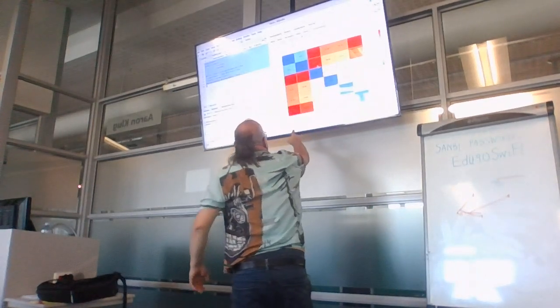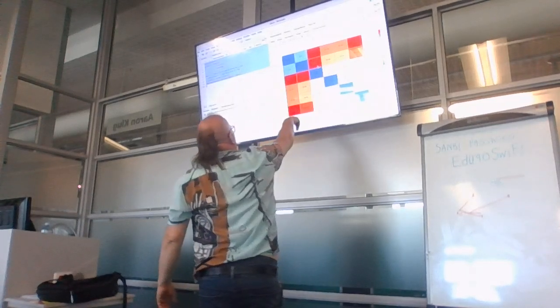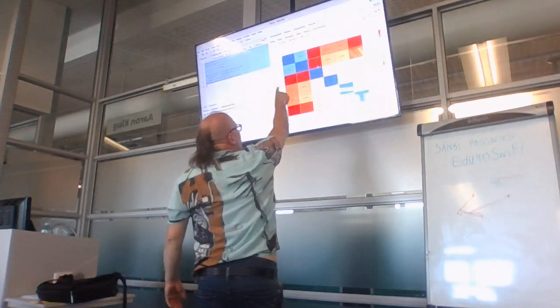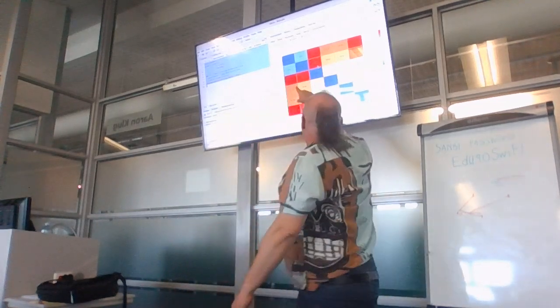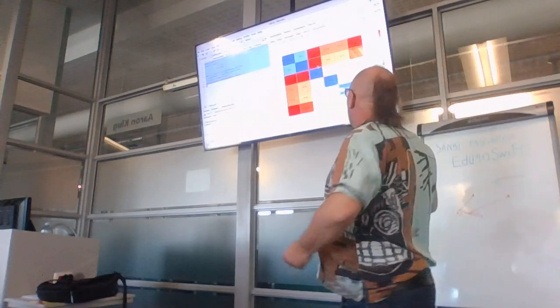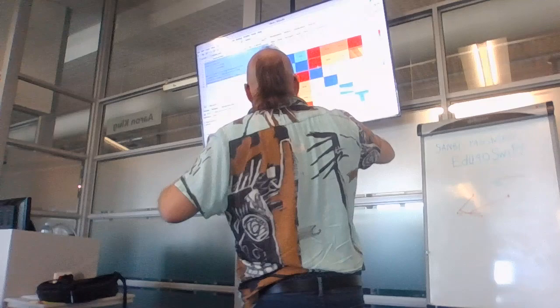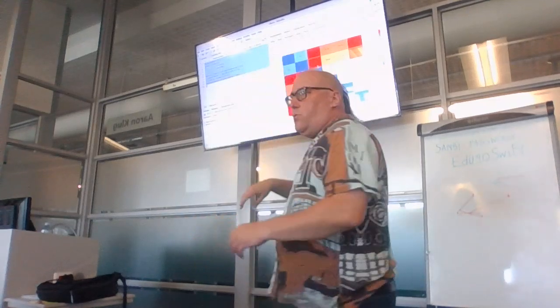But if we look at these two, 260 and 364, then we see that 260 is 4 SNPs distance from 364, right? The two are just 4 apart, but they're quite different to that other clade that we saw, okay?